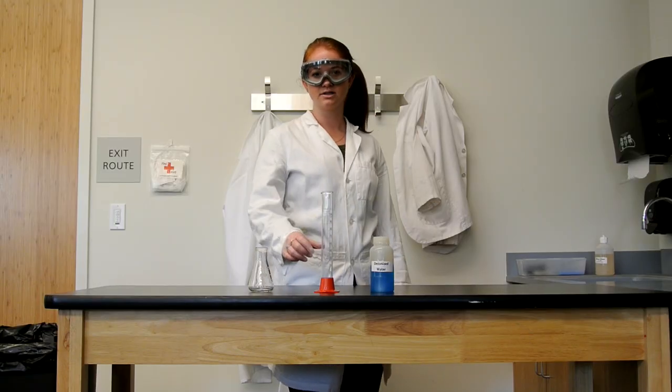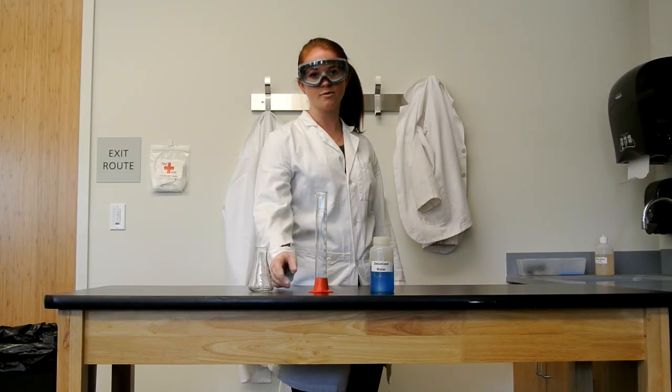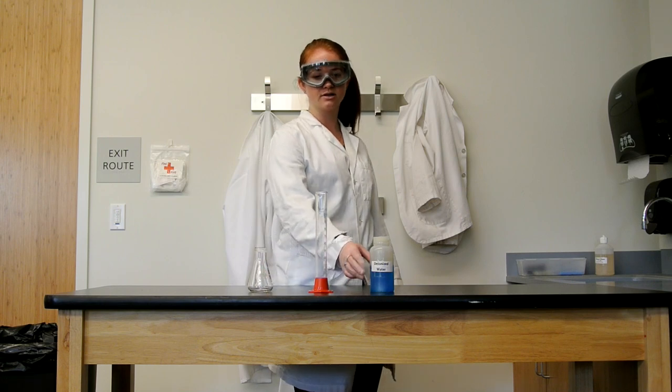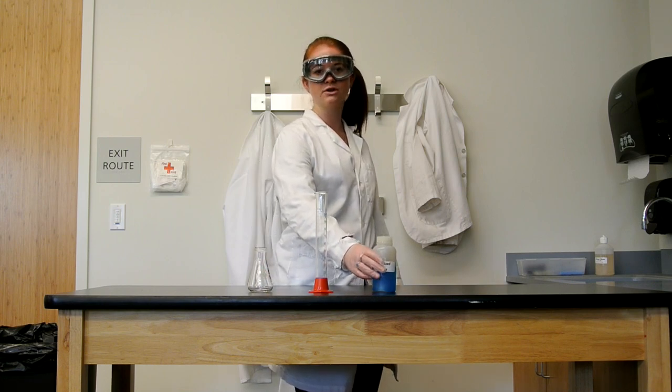Now, we're going to discuss how to measure liquids. You'll need a graduated cylinder, an Erlenmeyer flask, and your solution. Today, we're using deionized water mixed with food coloring so that you can see it.